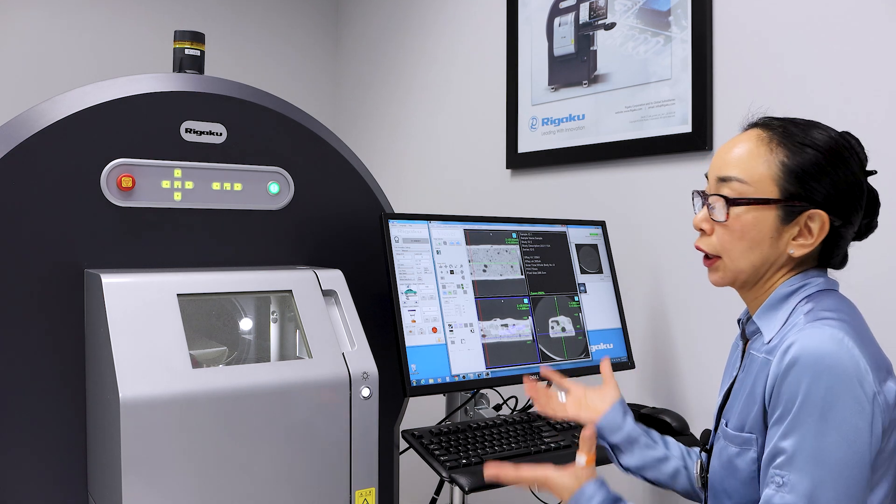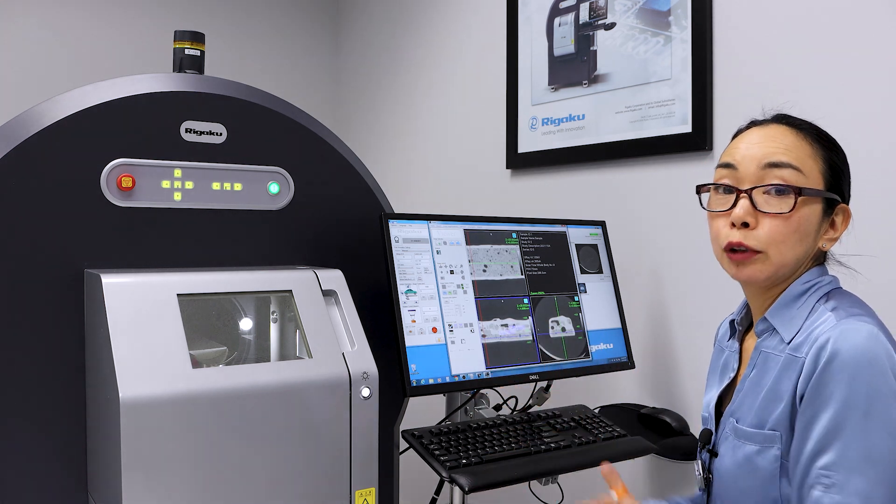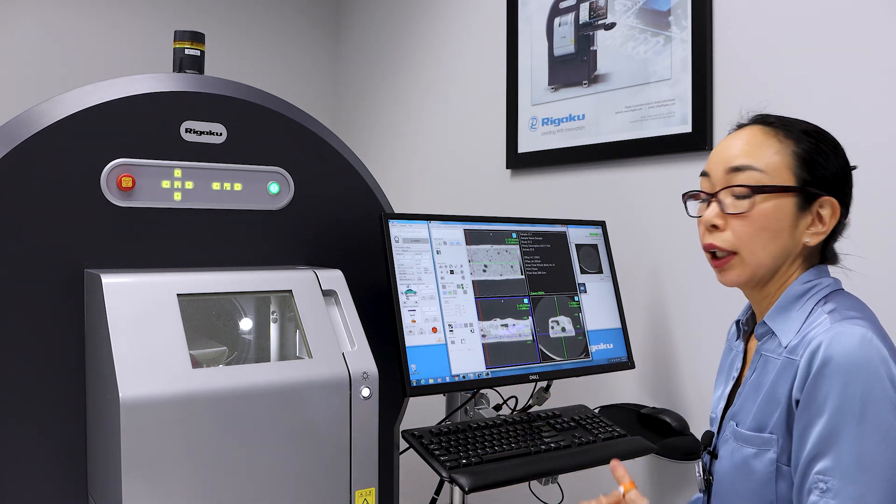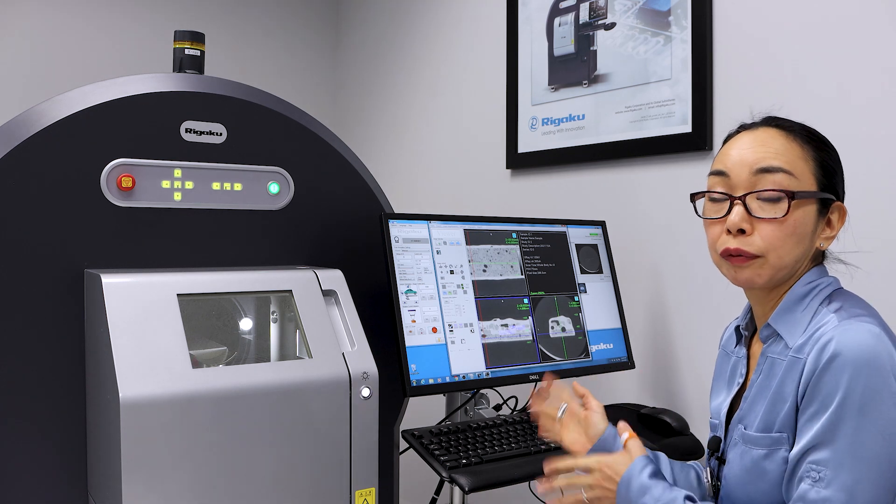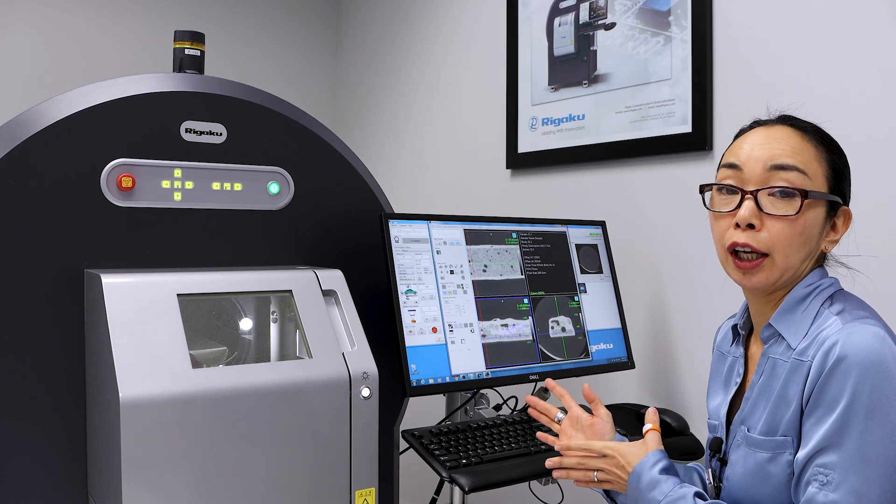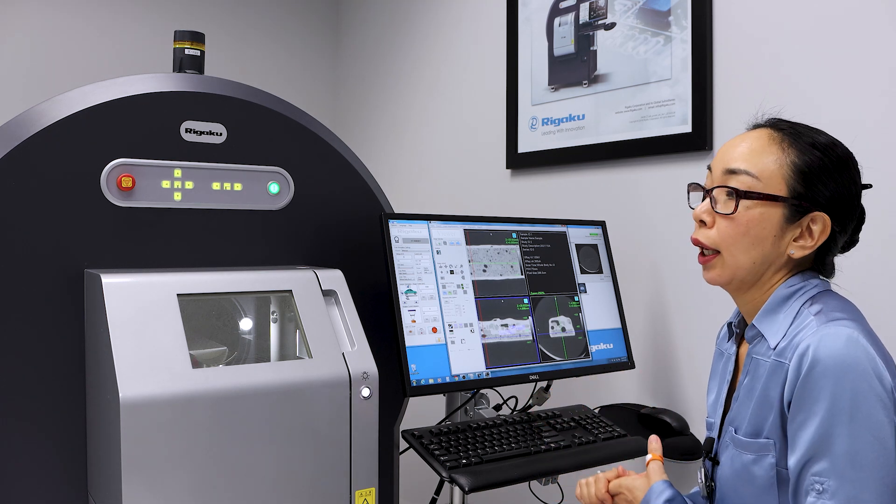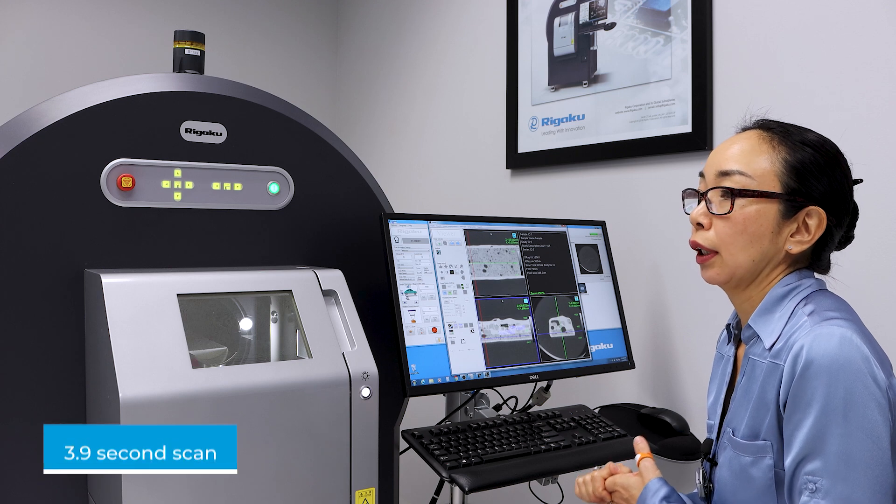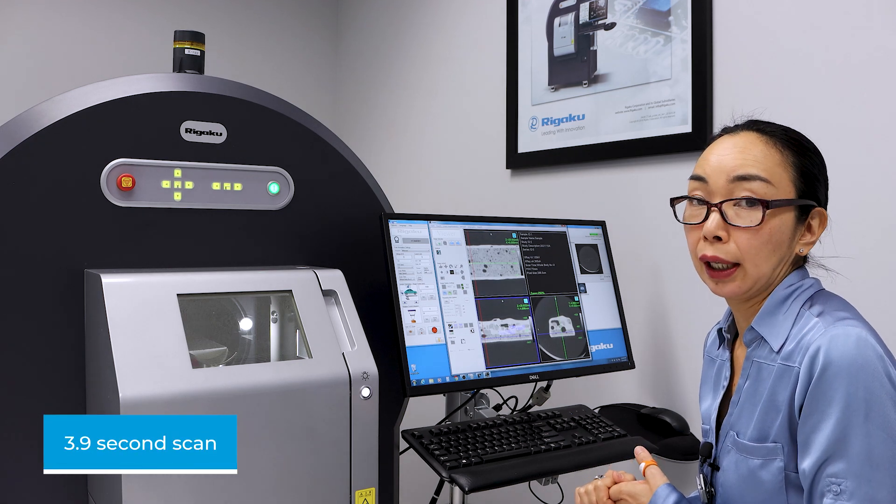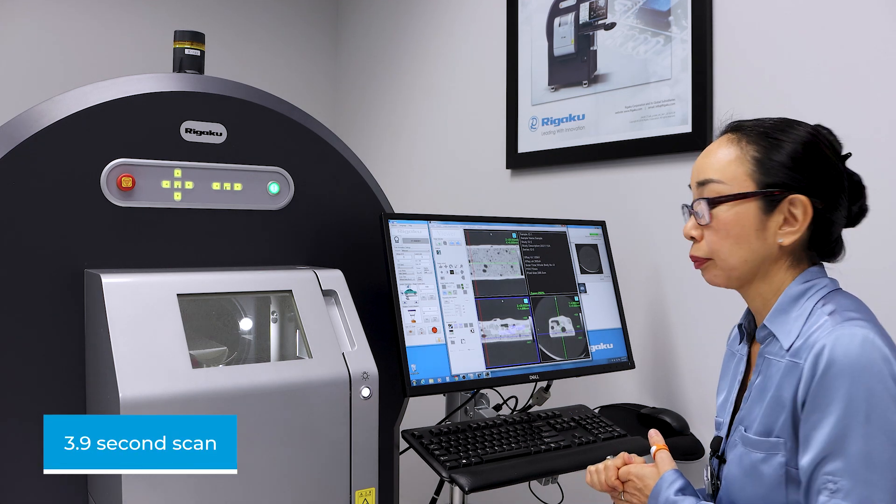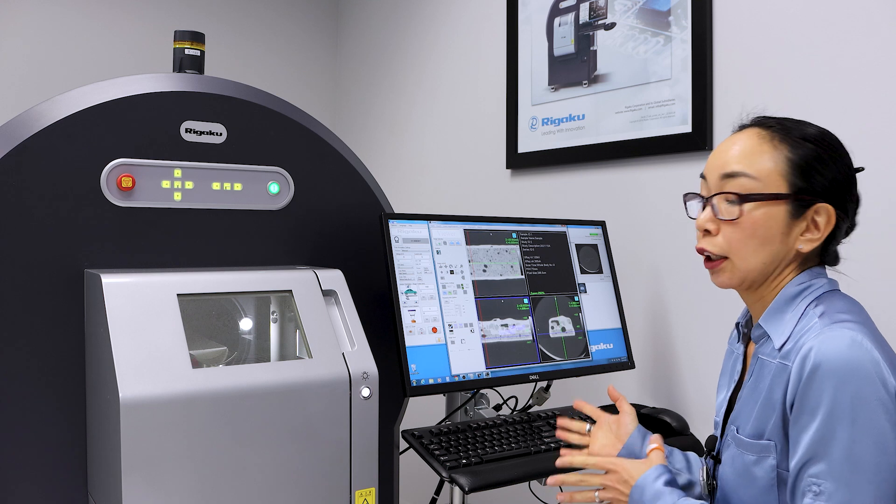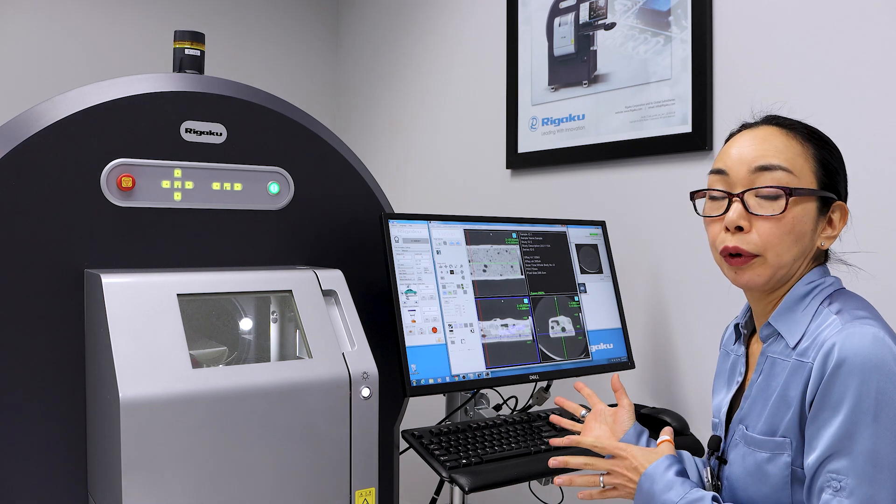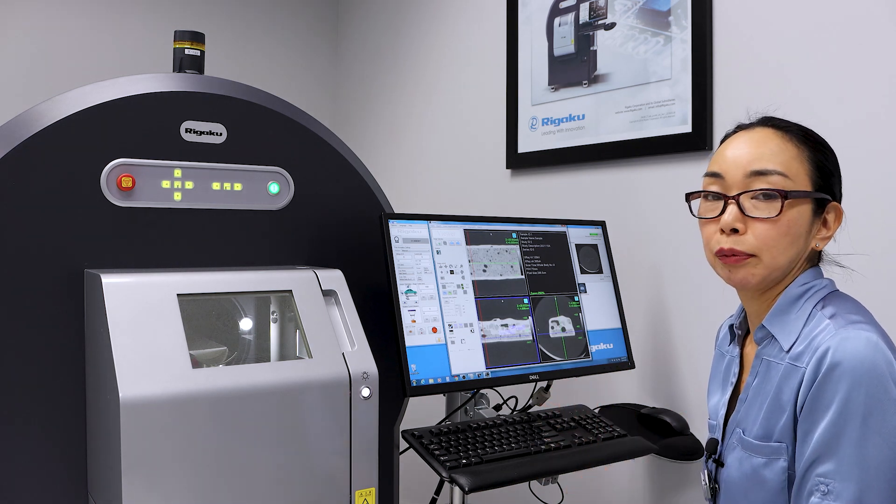So as you can see in this example, by using a CT scanner like the CT Lab GX, you can do a scan very fast. We did a 24-second scan for this sample, but this machine is capable of doing a 3.9-second scan as well. And you get to see the inside of the sample without destroying the sample.